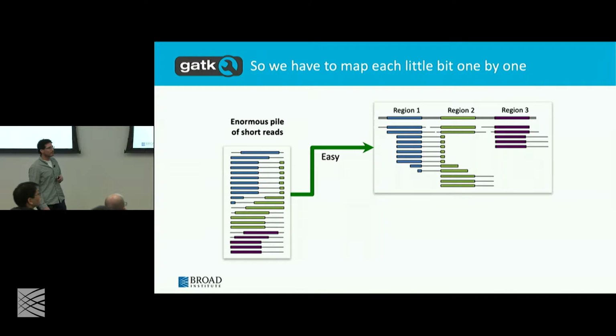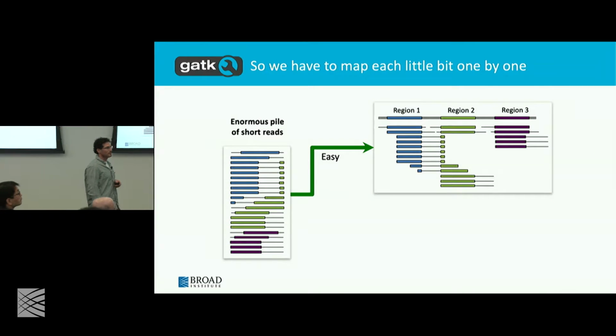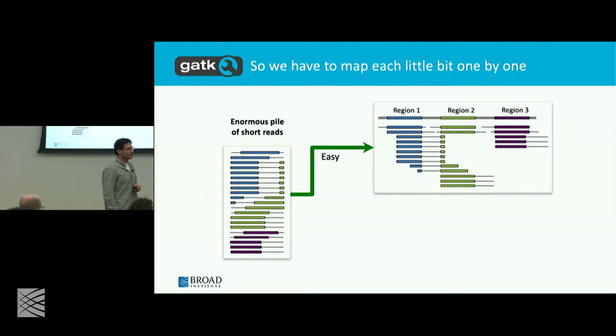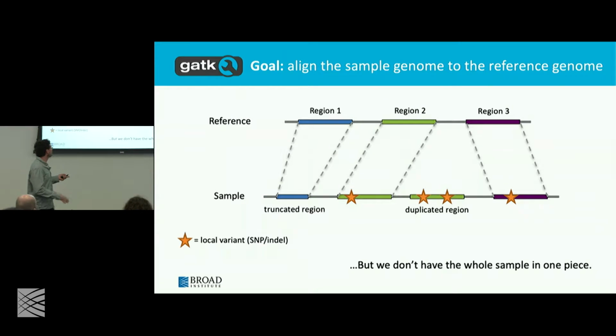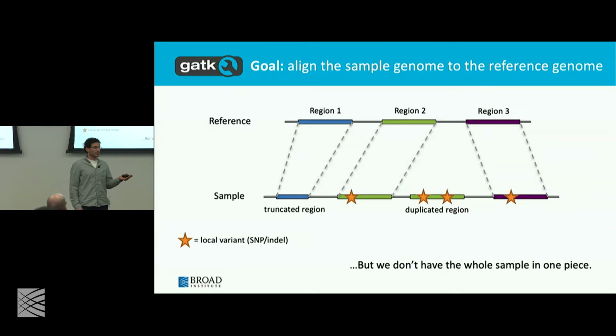There we go. Yes? How does it know if it's a copy number variation or if it's duplicated? The aligner doesn't know. The aligner has no idea. If the reads are shorter than the duplicated region, then all the reads over here will go here, and all the reads over here will also go here. And so that's why we need, and even the first attempt tools that we have, the HaplotypeCaller and Mutect and what have you, they will not know either.